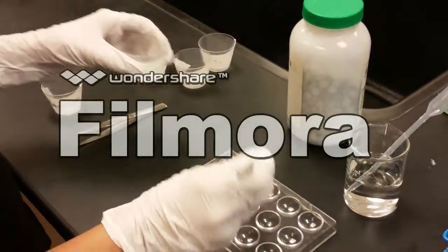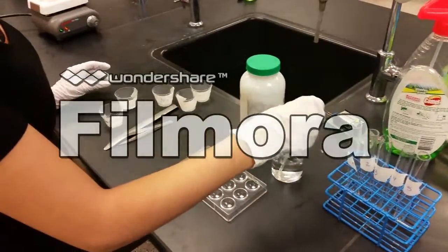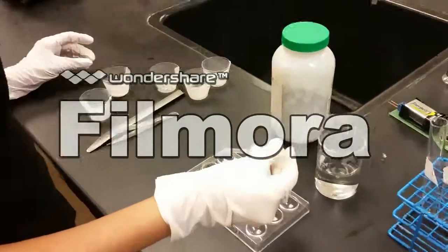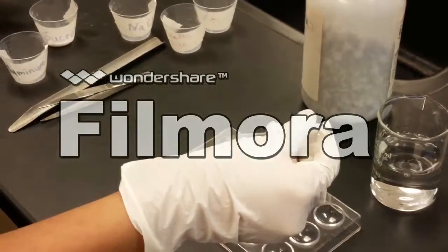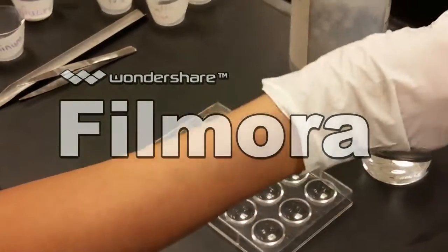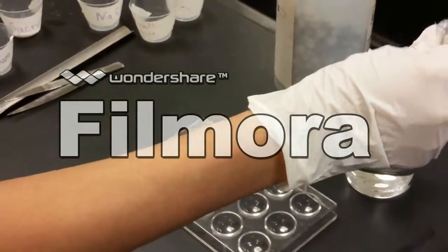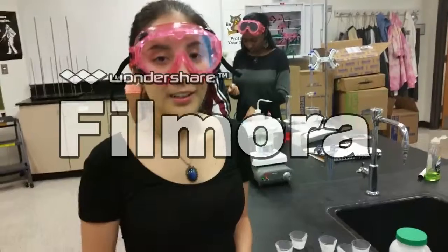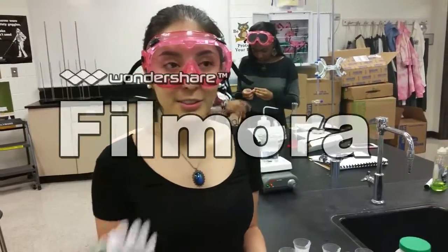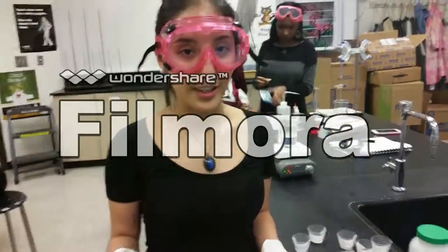Okay, so next we are testing the solubility of the solids in water. So you want to get a sample of each solid and place it into a different well in the reaction plate. And then go ahead and add about 20 drops of water into each well. You're going to then want to stir each well up using a toothpick to know if it is dissolving in the water or not.